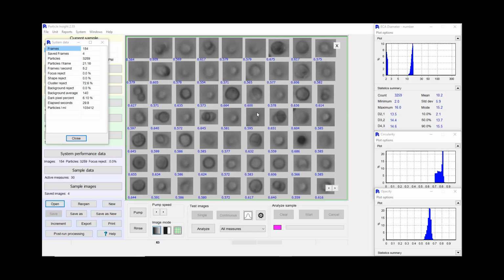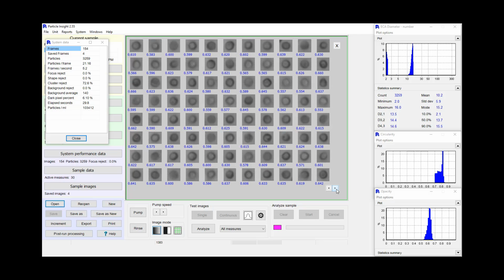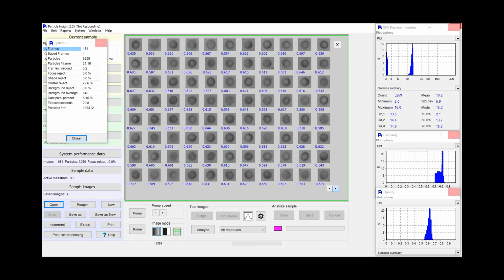Here I took a shot in the dark, saying that these are the larger round ones. I can also keep going and look at, out of the large round cells, which are the dark ones and which are the light ones. Or I could say, out of the large round cells, which ones are smoother. There are many different ways that you can look at this data and have it give you quantifiable information. So again, this is another tool where you can quantify what specific part of the population you're looking for.